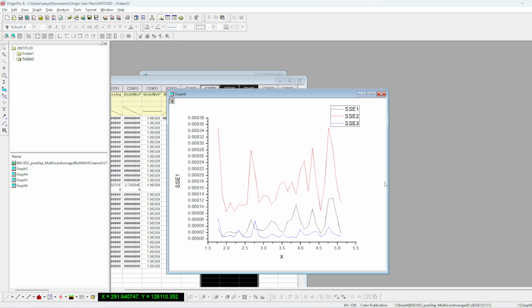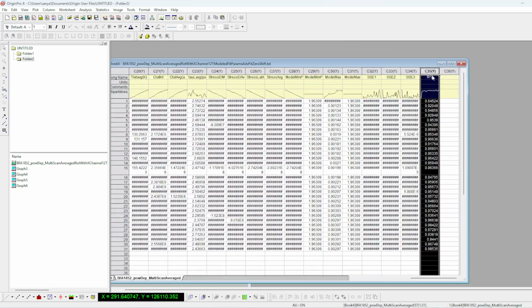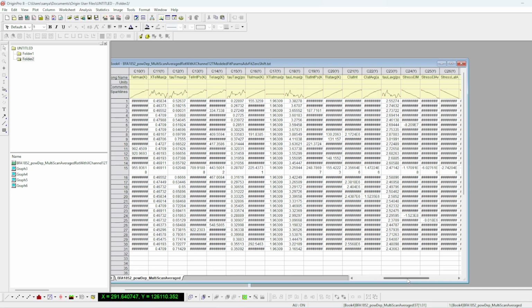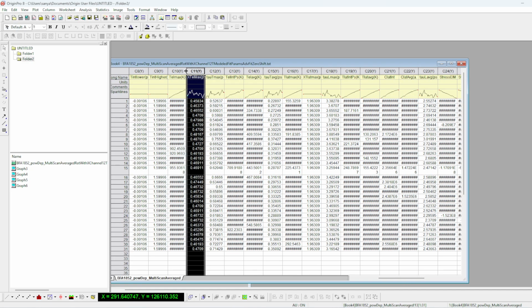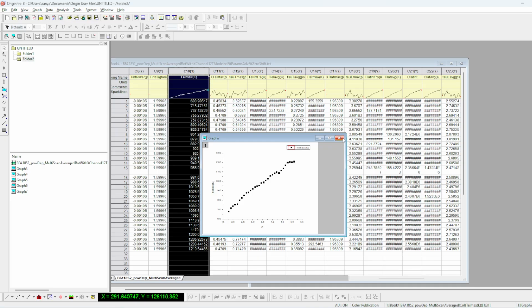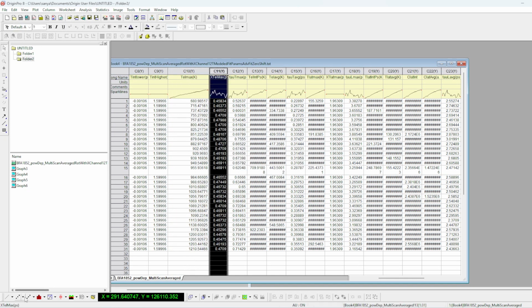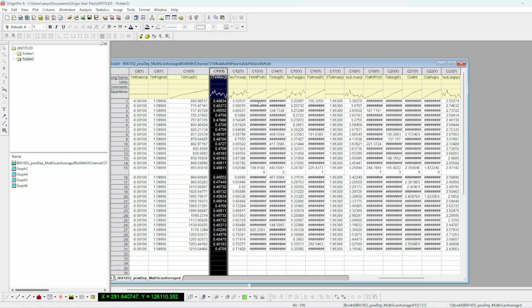This is more for diagnostic purposes. For statistical analysis, you're interested in the goodness of fit, R-square. And then you have the properties, for example, the maximum temperature of electrons that was calculated, and then the time, x was in picoseconds, where this maximum was achieved.